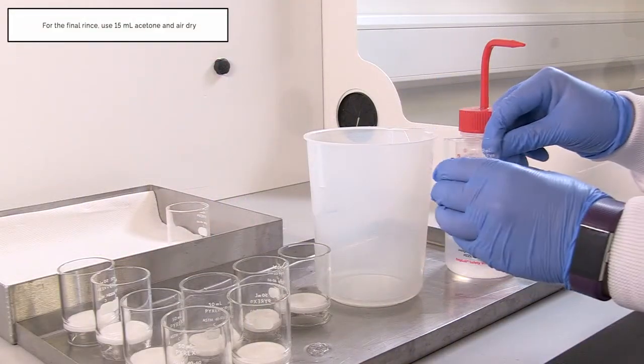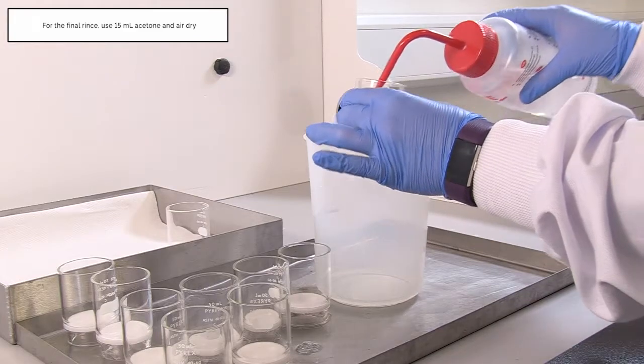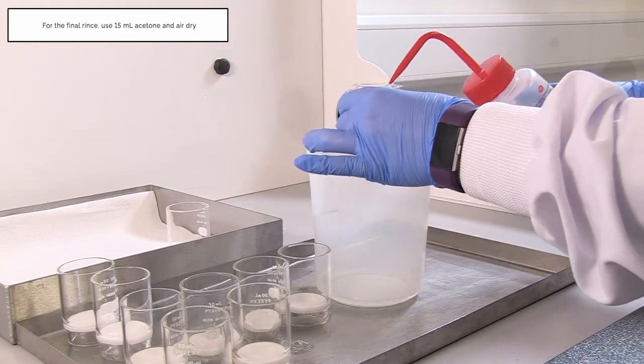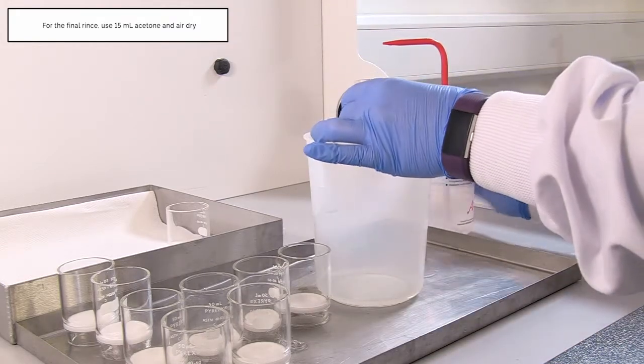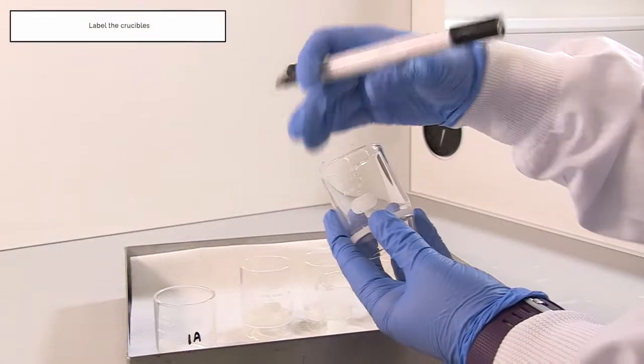For the final rinse, use 15 milliliters of acetone and air dry. Label the crucibles.